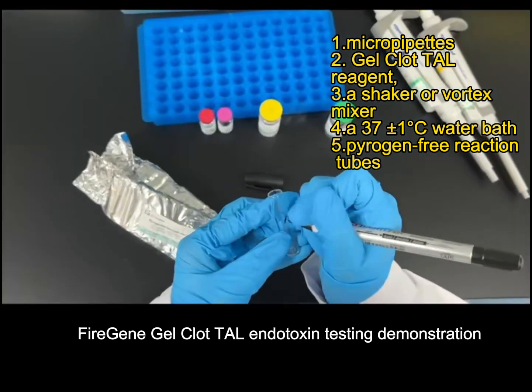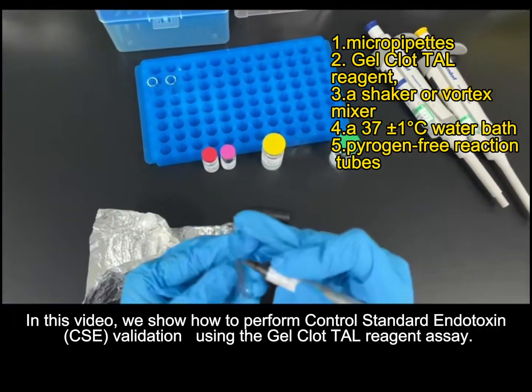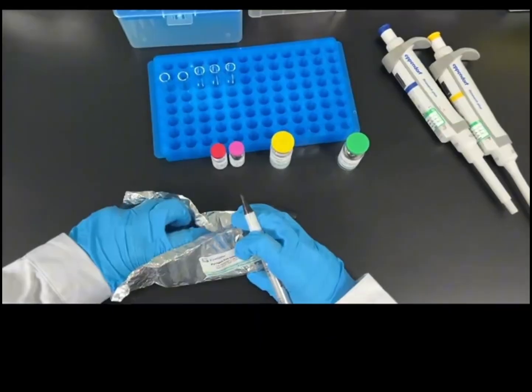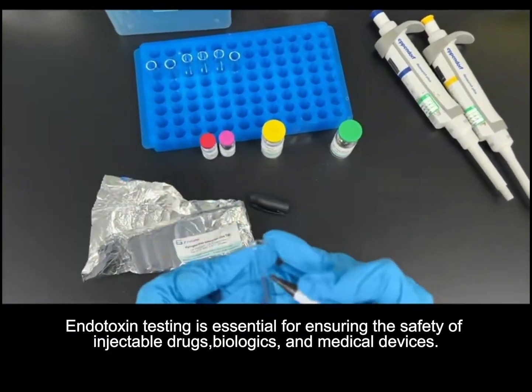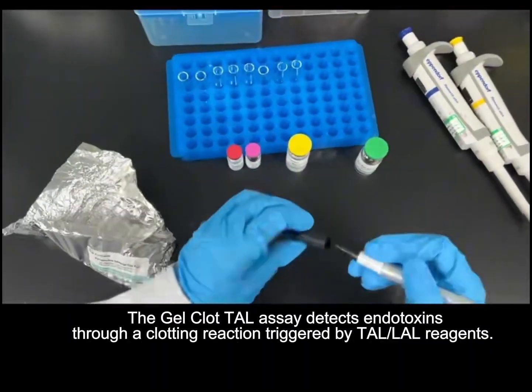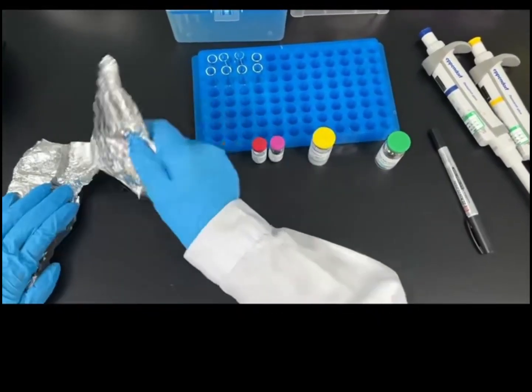Firegene Gel Clot TAL Endotoxin Testing Demonstration. In this video, we show how to perform control standard endotoxin (CSE) validation using the Gel Clot TAL reagent assay. Endotoxin testing is essential for ensuring the safety of injectable drugs, biologics, and medical devices. The Gel Clot TAL assay detects endotoxins through a clotting reaction triggered by TAL or LAL reagents.